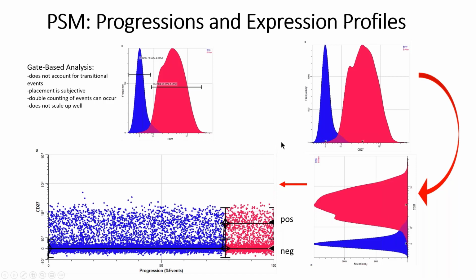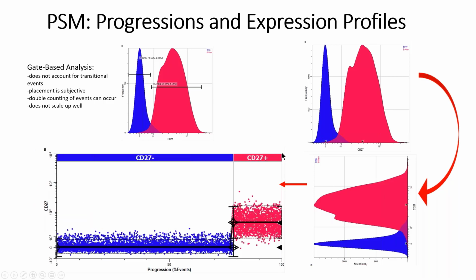So this particular sample is a B cell example, and we know that CD27 upregulates when B cells progress into memory B cells. We can see again that it's two black triangles which identify the negative and positive. The program actually positions the CDPs, the control definition points, based on those peaks for what we're going to call a step up, because CD27 upregulates.